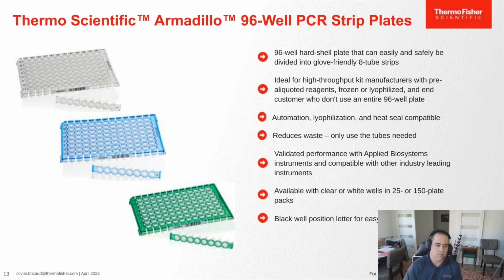But this plate has the feature that it can be snapped into rows of eight wells, strips of wells, which allows the flexibility to have an assay lyophilized into a 96-well format and then used in a much more flexible and less wasteful way by just snapping off rows.